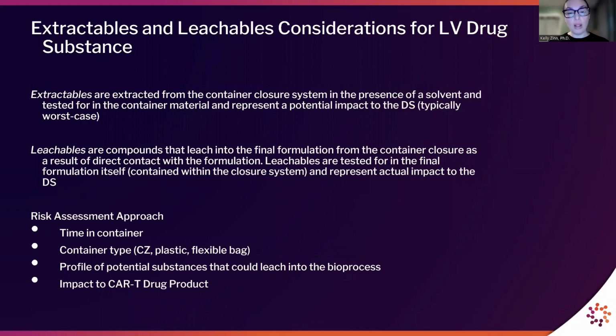Then looking at the profile of the potential substances that are identified as leaching from the vector container, and evaluating how those impact the CAR-T bioprocess. And then finally, determining the impact to the actual CAR-T drug product through the influence of the vector transduction process time and subsequent wash steps.